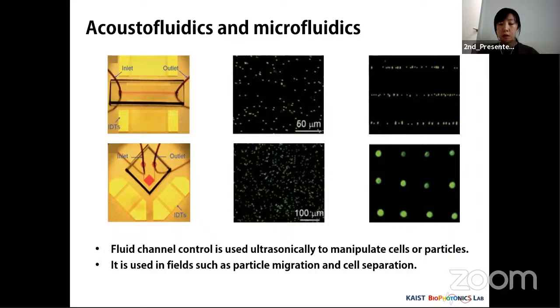Therefore, when ultrasonic waves are applied to a microfluidic channel, complex and unordered particles in the channel can be given a specific arrangement or selective separation is possible.